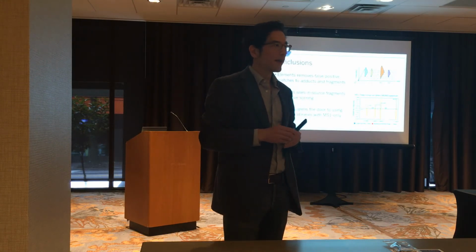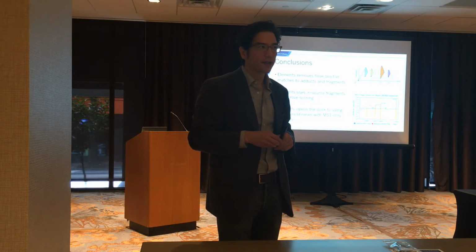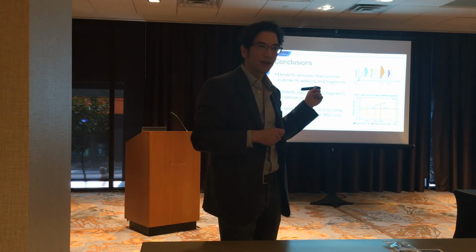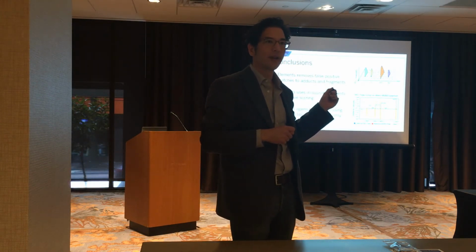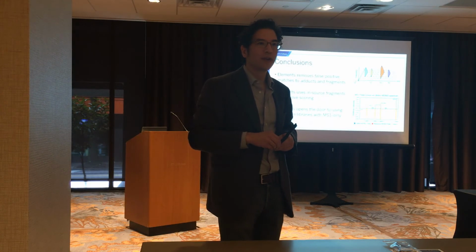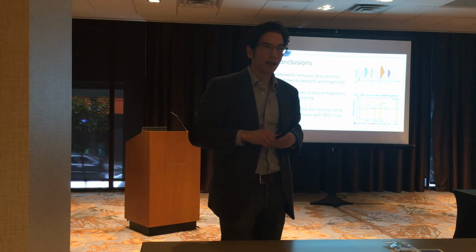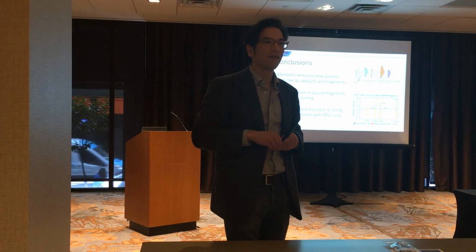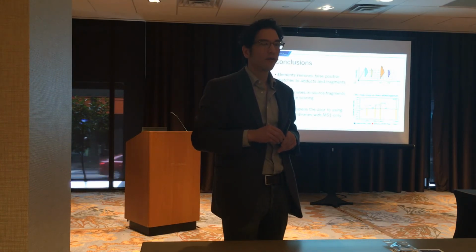Cool. So that's what we wanted to say about elements. Again, this is new stuff this year that we've been pretty excited about. The idea that we can start to think about using this strategy for proteomics is also something that we're pretty excited about too, because we do see a lot of these in-source fragments as well in proteomic data, and those get database searched just like everything else, right? So I think that's one of the hidden advantages that we see with DIA, where you're not as beholden to these in-source fragments.